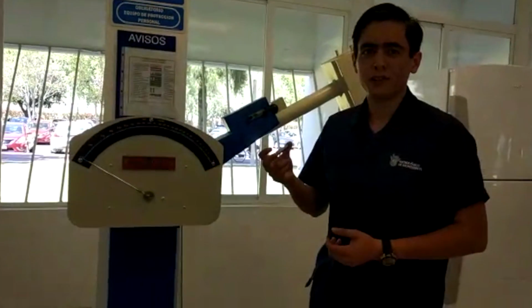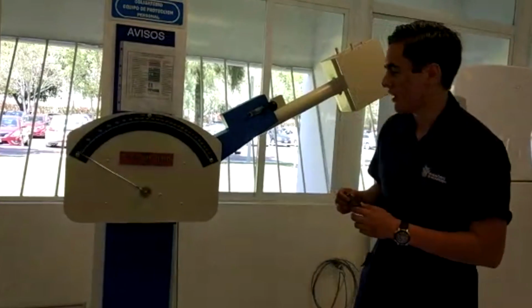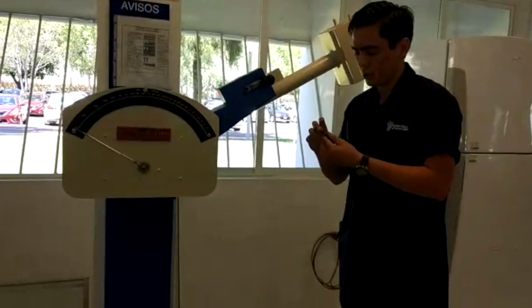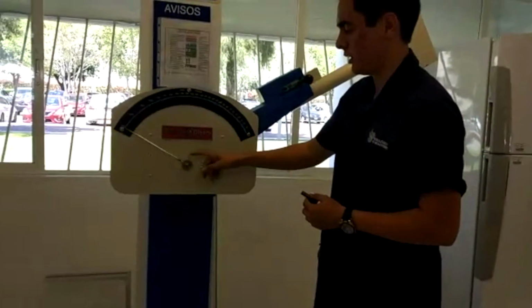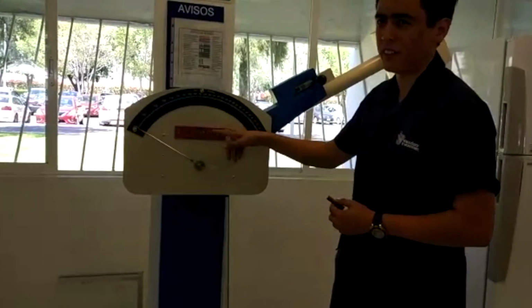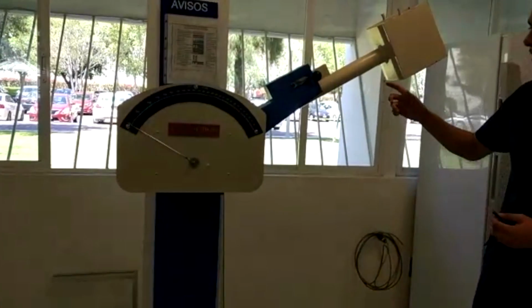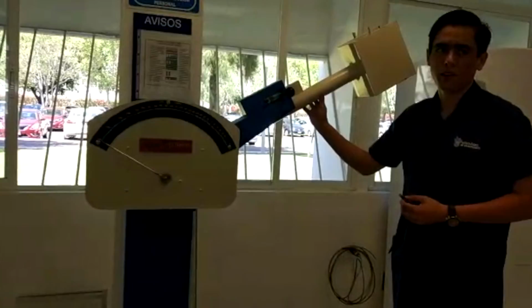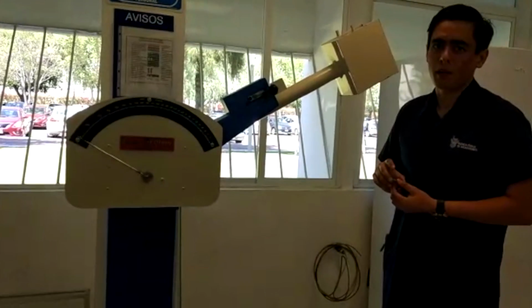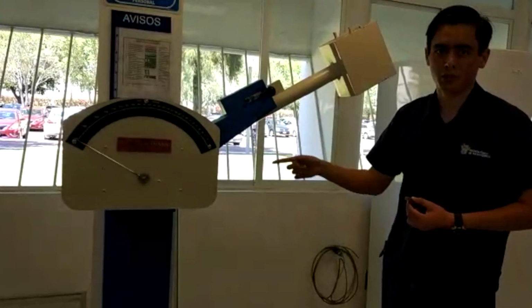In order to test the impact resistance of a piece, you need a pendulum, like this one right here. First, you need to make sure it's aligned to zero, all the way to the other side, so the measurement is correct. The pendulum calculates the force that the material absorbs by the difference of height when the pendulum returns.